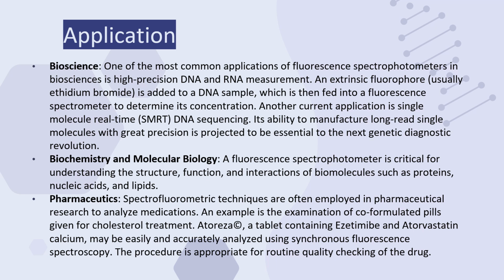An extrinsic fluorophore, usually ethidium bromide, is added to a DNA sample, which is then fed into a fluorescence spectrometer to determine its concentration. Another current application is single molecule real-time DNA sequencing. Its ability to produce long-read single molecule sequences with great precision is projected to be essential to the next genetic diagnostic revolution.